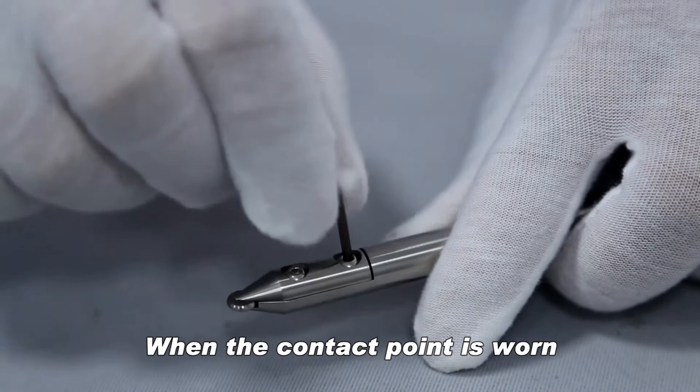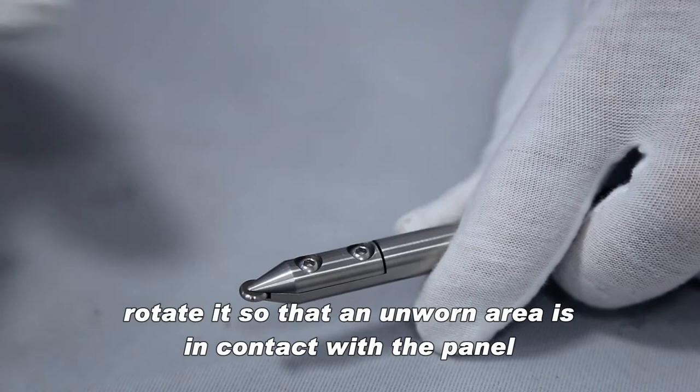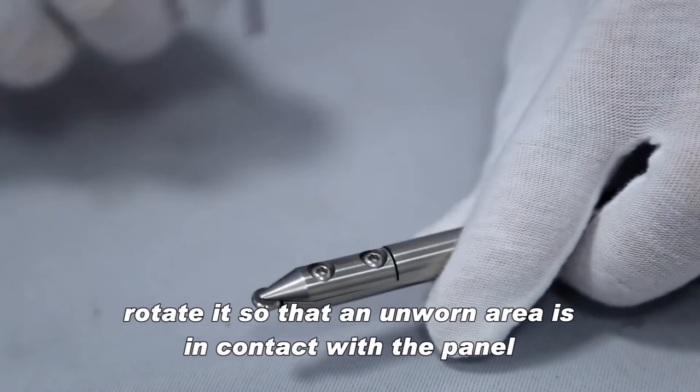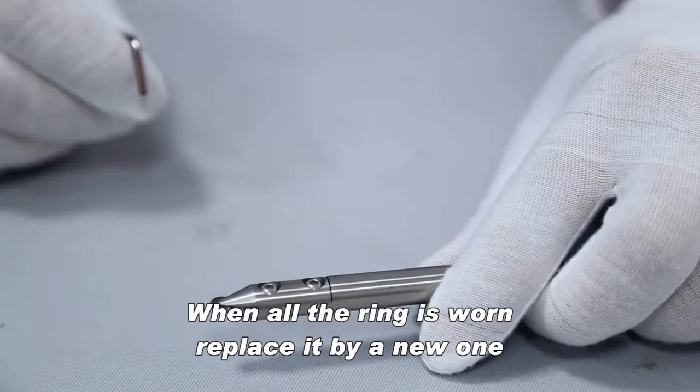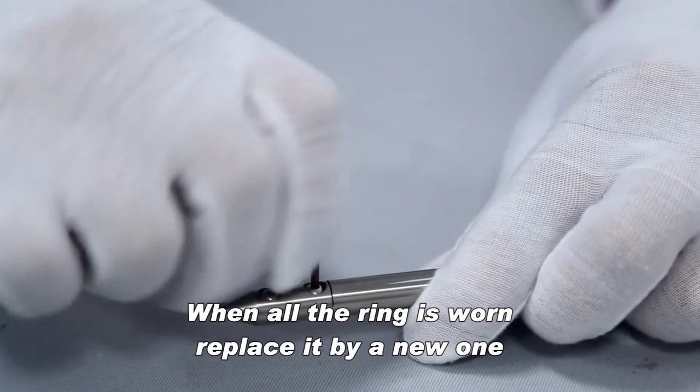When the contact point is worn, loosen the stylus compression screw with the supplied wrench. Rotate it so that an unworn area is in contact with the panel. When all the ring is worn, replace it by a new one.